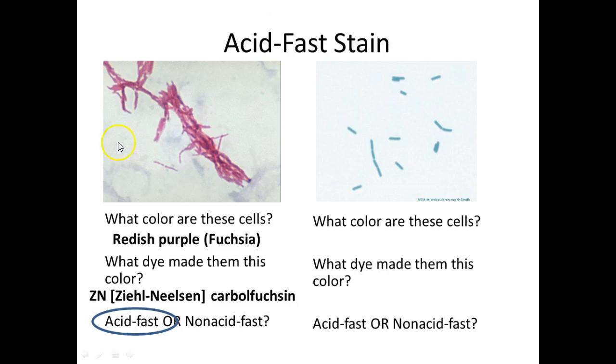Now, notice that these cells clump together. But when you see the individual cells, they are rod-shaped. And that's why I was so excited about my slide today. You could actually see individual cells, and you could see that they were rod-shaped.